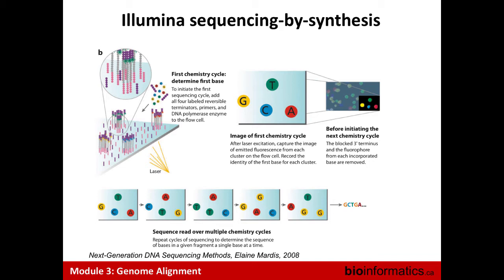When this cluster has been generated, you will start your sequencing. You will have an adapter that fixes to the top of your sequence, and after the adapter, you will bring your bases, and each cycle of the machine will bring one base to each sequence. You can imagine that as all the sequences from the same cluster represent the same DNA molecule, they will bring the same base for this cluster.